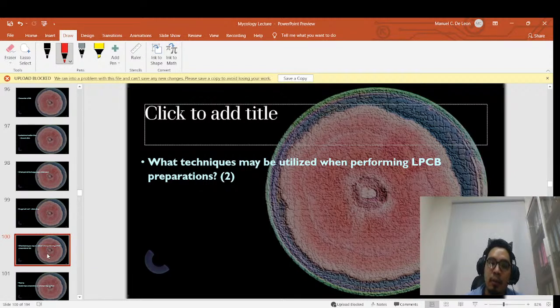You separate the strands, because these things are fluffy, such as the one that I'm presenting to you now. This is a mold, such as our background of the PowerPoint presentation. So the background of the PowerPoint presentation is actually a mold. What you do is you collect a small amount of it, specifically in the outer rim, because the inner rim is a little too fluffy and you might aerosolize some of the infectious particles. So we want to avoid biohazards.